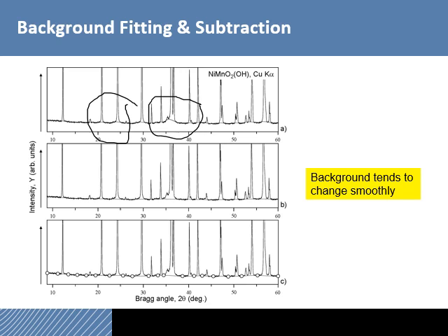You do have to fit a background to do your analysis, but you do not have to subtract the background. Most software has the ability to actually subtract it. You will see that a lot of diffraction patterns, when they first come out of the diffractometer, tend to follow that kind of a shape, where you have a very high background in the low end of the 2 theta range. That's primarily scattering off the sample holder.